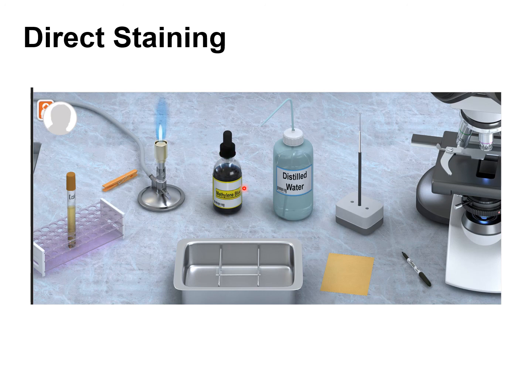And then right here, you're going to be using methylene blue. That's the basic dye, so it's going to be staining the bacteria cell itself, not the background. And this is usually the bottle of water that we use. We usually work right here on top of a staining tray where we lay down our slide, and you do all of your work so that when you put the stain and you wash it and everything, all of that excess stain and water goes directly into that tray.